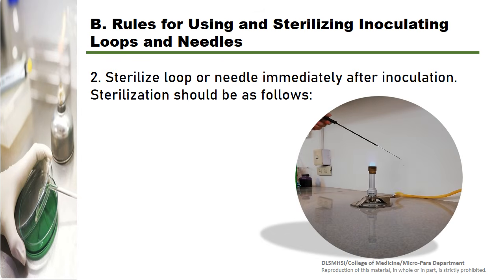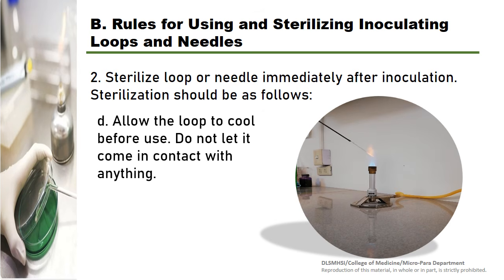This is a demonstration of how it is performed. Remember, we use the blue flame and start at the junction of the wire and the handle, slowly heating it to red hot as you move towards the loop end. After sterilization, allow it to cool and do not let it come in contact with anything.